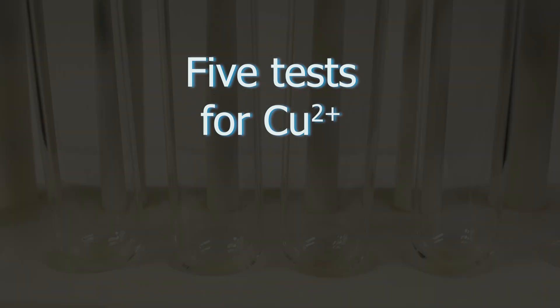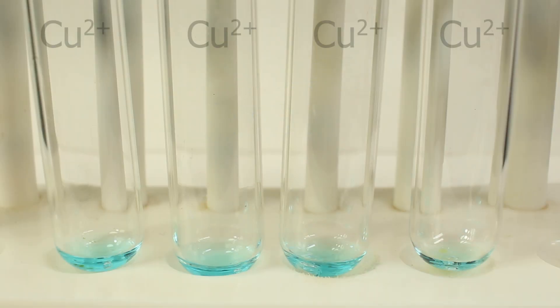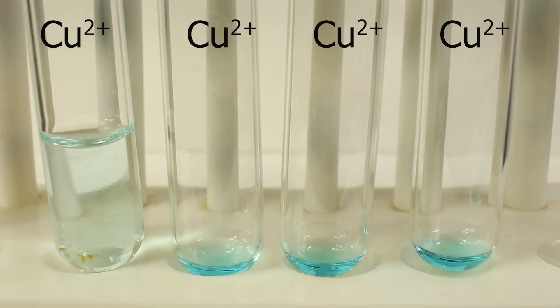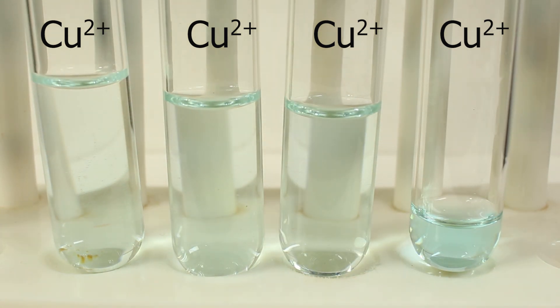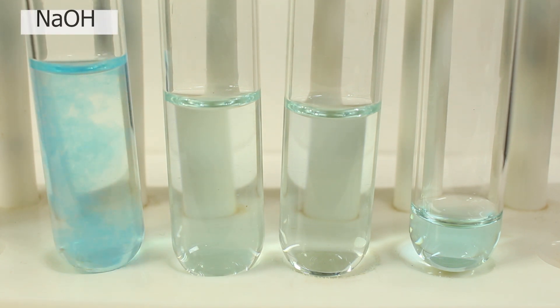Let's run all five tests for copper in first sequence. We need a bit higher concentration for potassium iodide test, so I don't add so much water otherwise the reaction doesn't run. Sodium hydroxide, blue precipitate of copper II hydroxide.